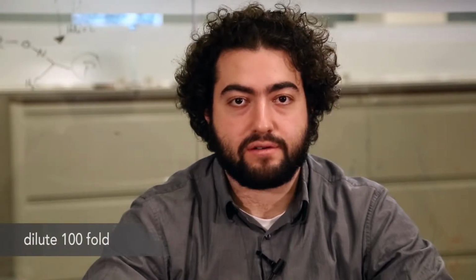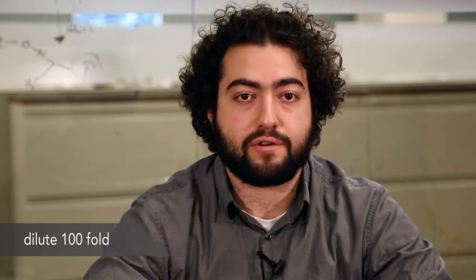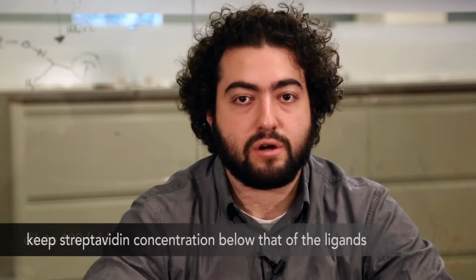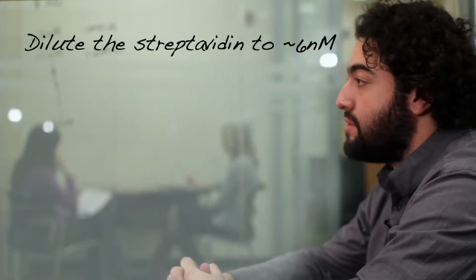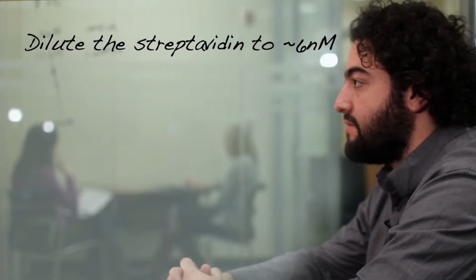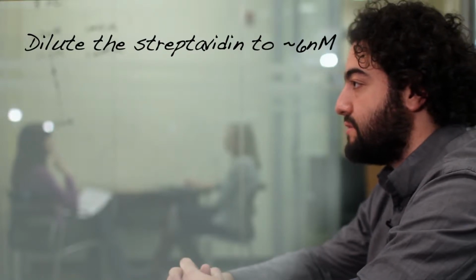To avoid capping, or the binding of two streptavidin molecules to one construct, thus rendering that construct unloopable, the streptavidin concentration should also be well below the effective concentration of the ligands on the scaffold, which for vars 4 and 8 is roughly 30 nanomolar. To achieve this, we will dilute the streptavidin to roughly 6 nanomolar, so that when mixed in equal volumes with the scaffold, the final concentration of the streptavidin is 1/10 the effective concentration of the two biotins on the loop.